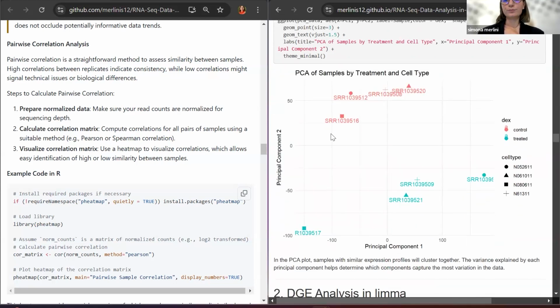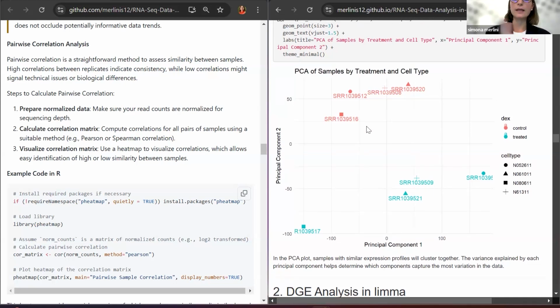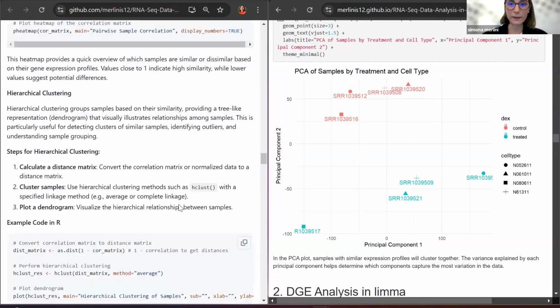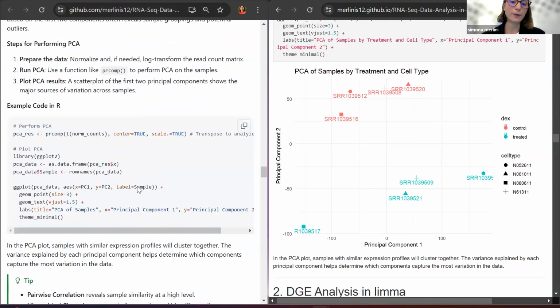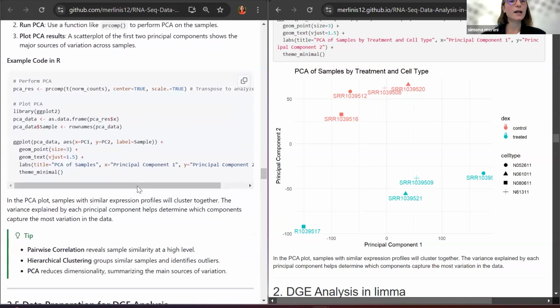You can also plot your data in the new space divided by cell type. So here I reported condition and cell type together, and you can see that, again, the main variation is carried by the condition and not the cell type. Okay, so I think that with this we are almost ready to actually perform the DE analysis.